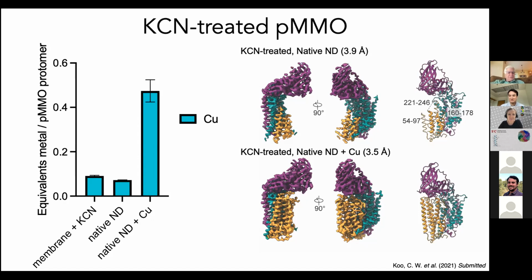I'm not sure it's even clear in X-ray crystallography how that exactly is done. Density maps generally aren't really well distinguished by their density values as to what kind of molecular weight is involved. So it's a difficult problem. Yep, that's right. In X-ray, you use anomalous scattering.